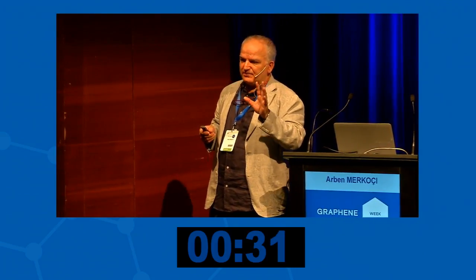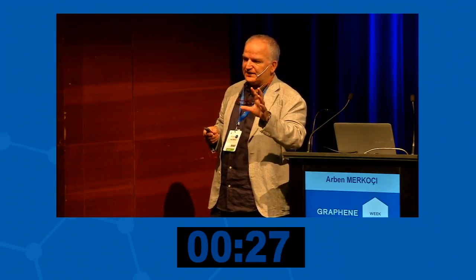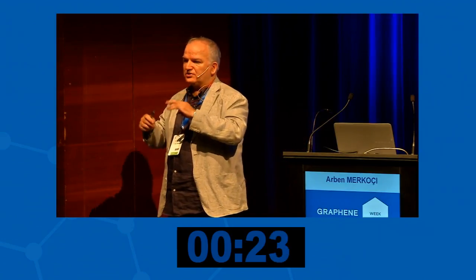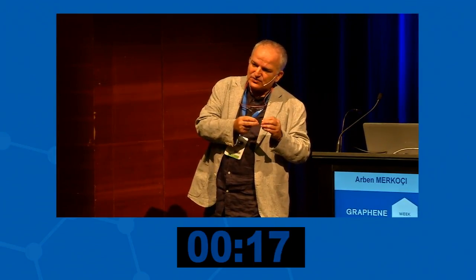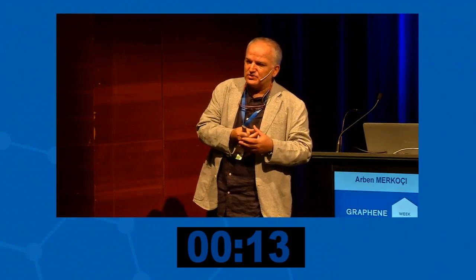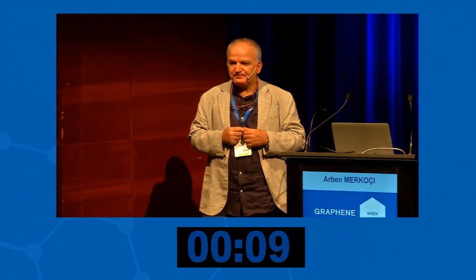The main objective of the chip is to do the detection. So we are detecting this analyte in the water. The idea is not to do decontamination. We are just removing what we are using in this chip. So it's a kind of decontamination during the detection process, not for industrial purposes. Yeah, okay, I see.